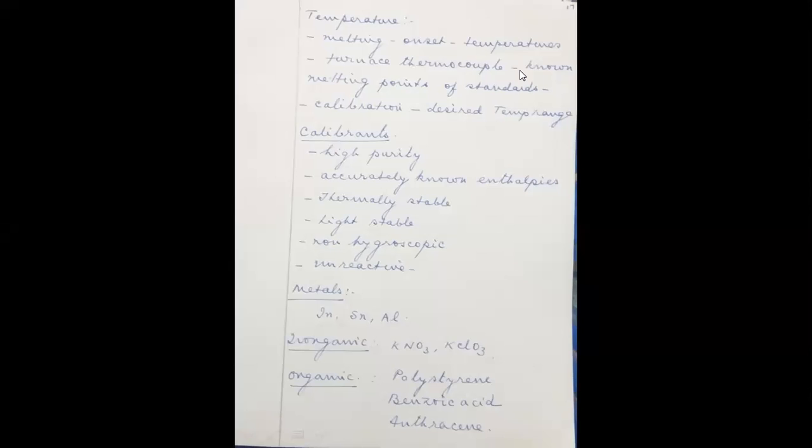In order to understand the behavior of the differential scanning calorimetry, first of all, it has to be experimented with substances whose melting points are well known. So the melting point of a standard substance is known, and that substance is taken, kept in the differential scanning calorimeter, and then it is studied. So this is called a calibration of the instrument.